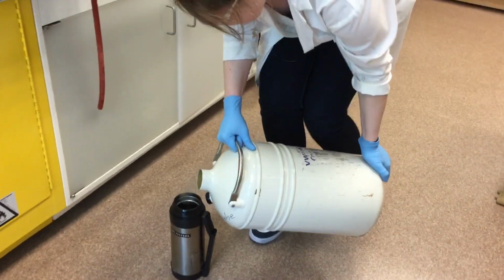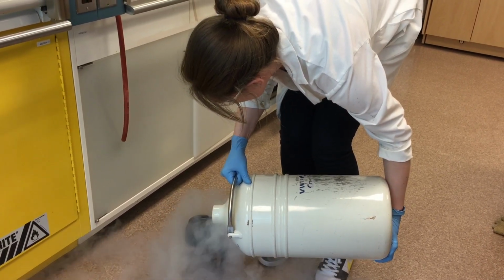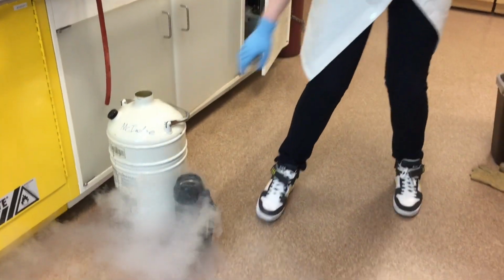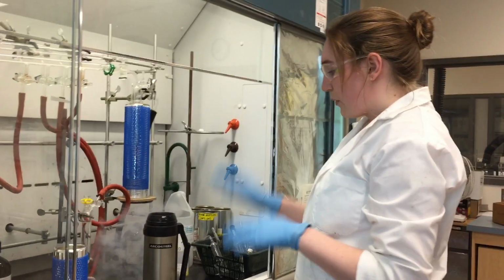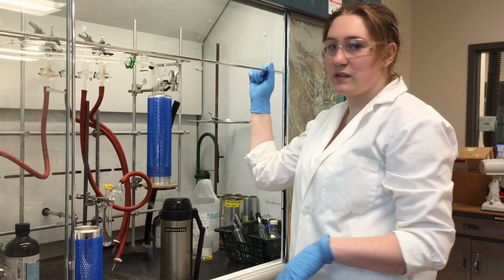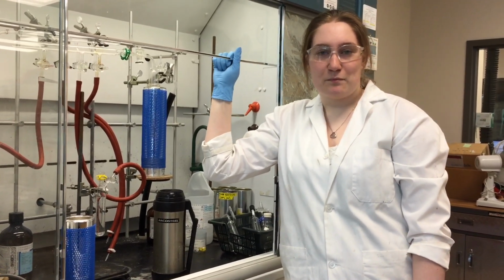So now I'm going to fill a secondary dewar with some liquid nitrogen. Next what I'm going to do is pour the liquid nitrogen into the dewar. It's really important that when you pour the liquid nitrogen into the dewar, within 20 seconds you turn on the vacuum line. Otherwise you will just be condensing oxygen and forming liquid oxygen.